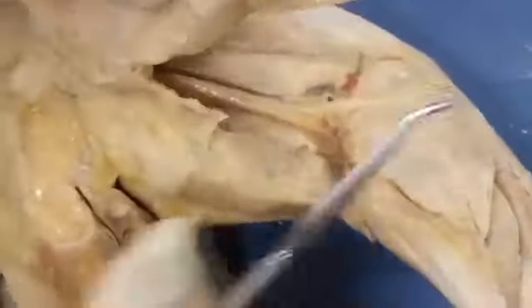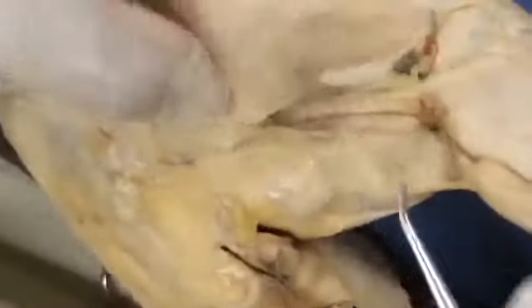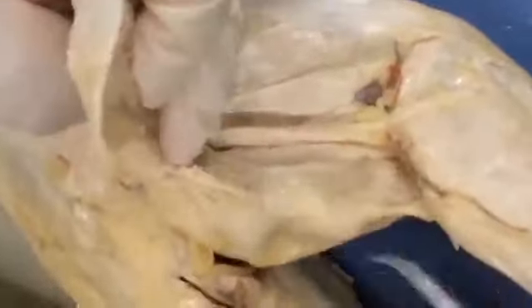Going back to the posterior thigh now. This is where we're really going to see the hamstring group. In this case, these are kind of clearest. We might have to swap cats here. The posterior thigh, the hamstring group now, which are going to be the antagonist to the quadriceps group.